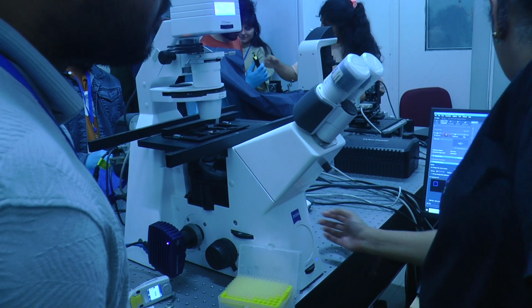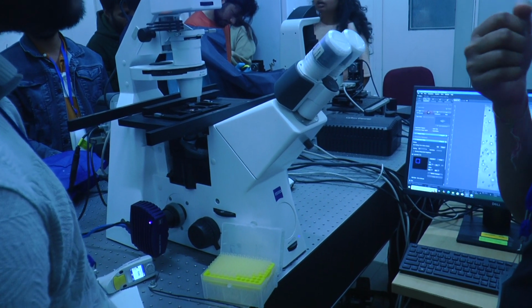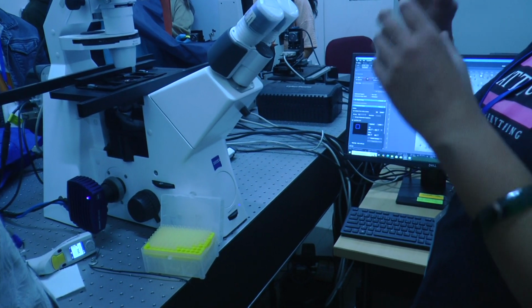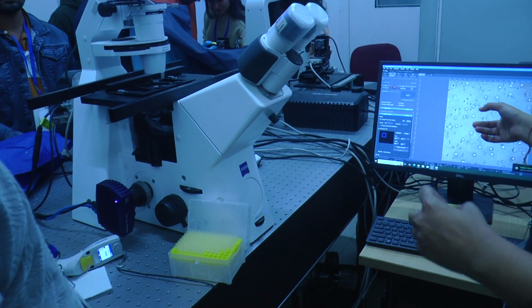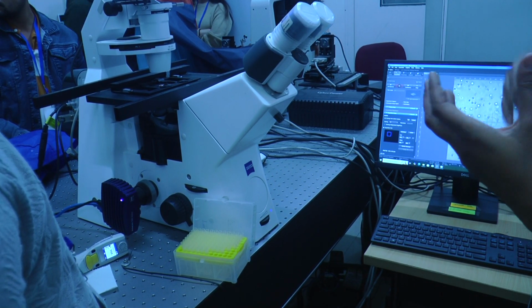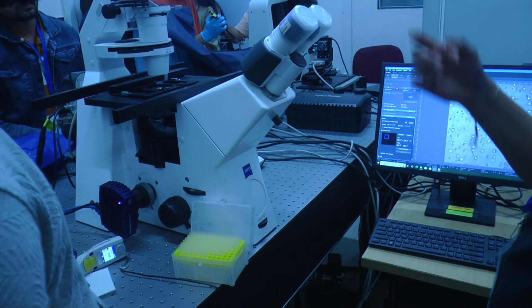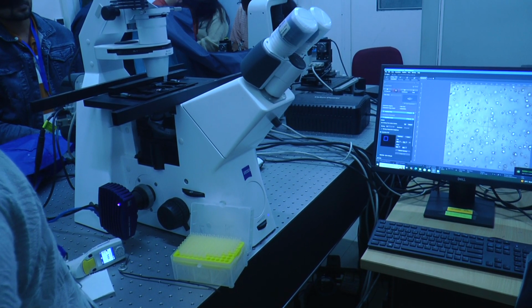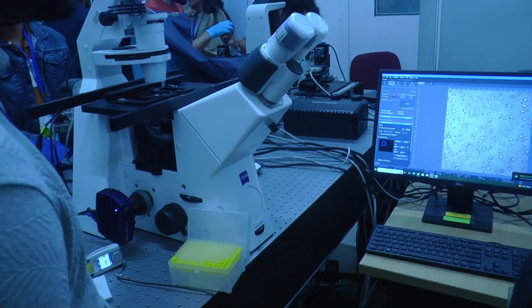Why is it showing like this? I think you put less blood. Yeah, you put less blood, not in the concentration we wanted you to put. Very few red blood cells are having a lot of salinity. Because he put less blood in the sample, it's created. Yeah, you can see this picture. This is like a mimic of 1.2%.